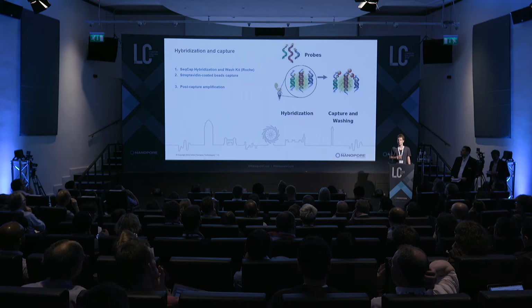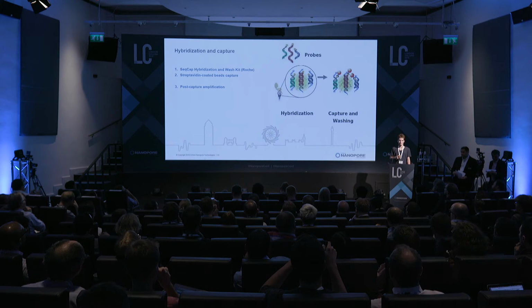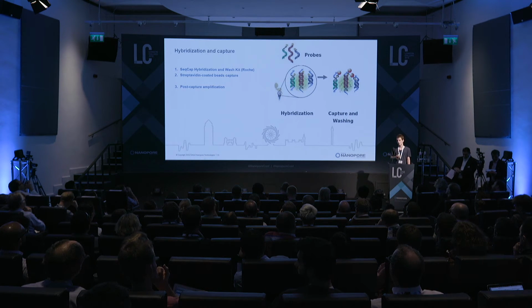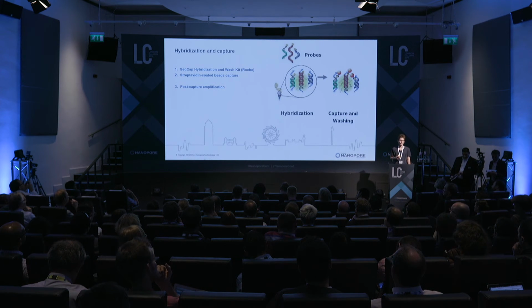The next step would be to perform a hybridization capture, then fishing out with streptavidin-coated beads, followed by another post-capture amplification, after which these fragments can be put on the MinION sequencer.